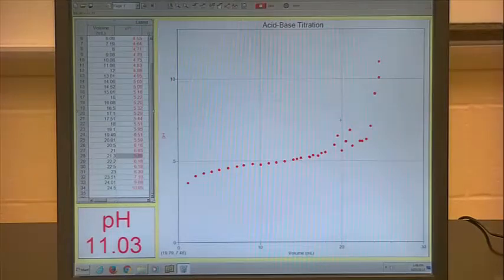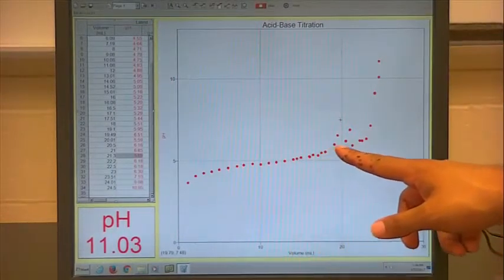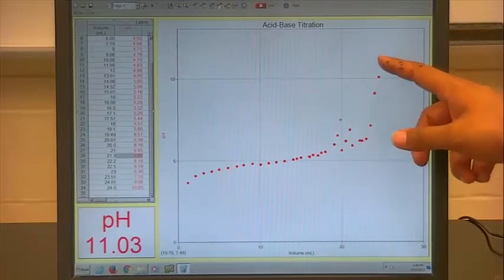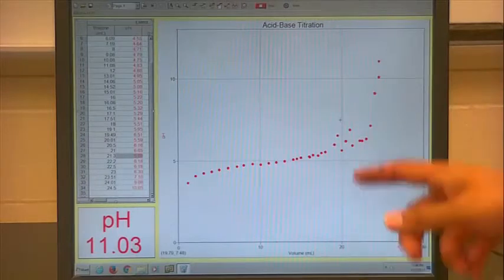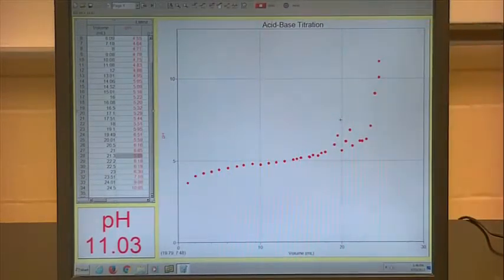So you want to be very careful with your titrations. The overall curve should be something like this, a smooth trajectory, and then at high volumes, which imply a high amount of NaOH, you should have this increase in pH. So once again, it's a pretty good pH titration curve. How will we get the equivalence points here? So that is where you want to use the first derivative.